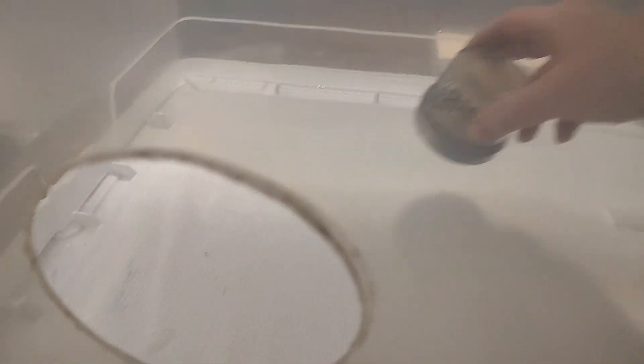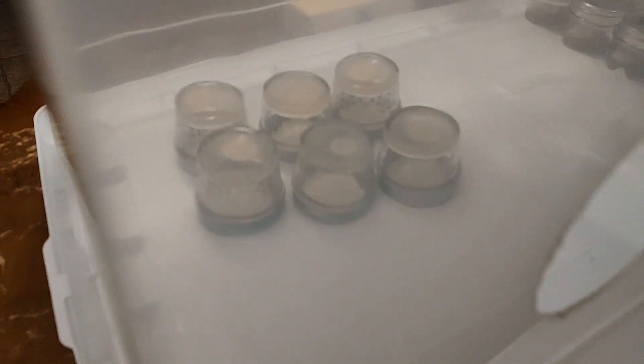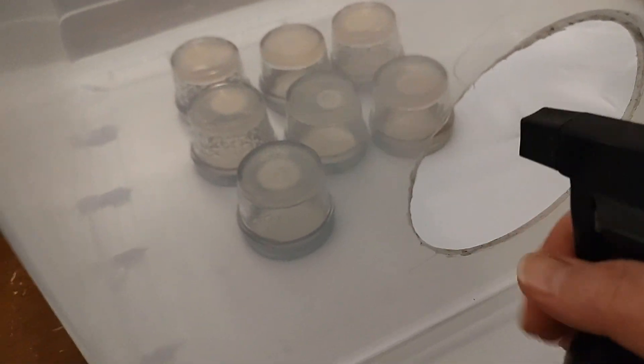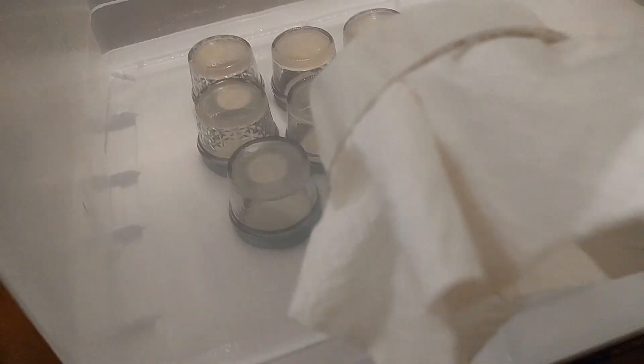I'm going to clean this side with this paper towel and take those out, but for right now I'm fumigating. I'm going to put what's going in next so I load it while it's super saturated. 91% alcohol is what we use. This is an actually incredibly requested video, so I'm glad I could do this for you. This is what's next, and then I like to take the paper towel and do like this.